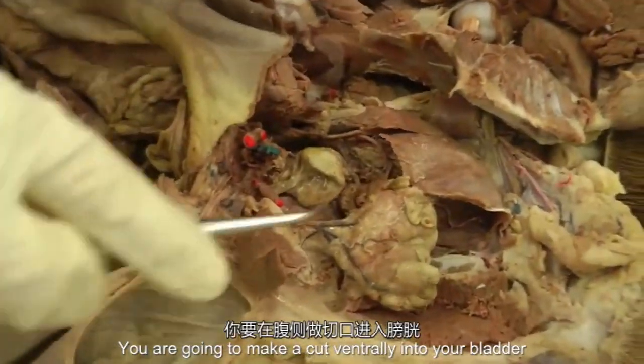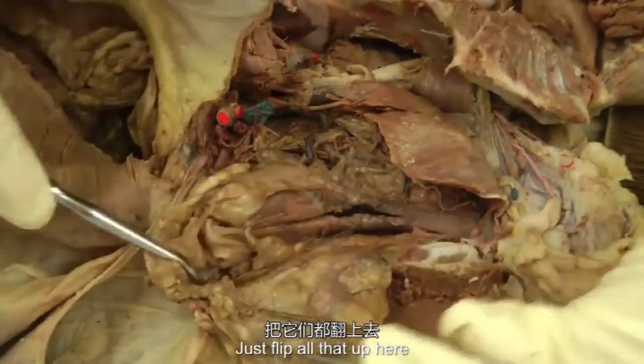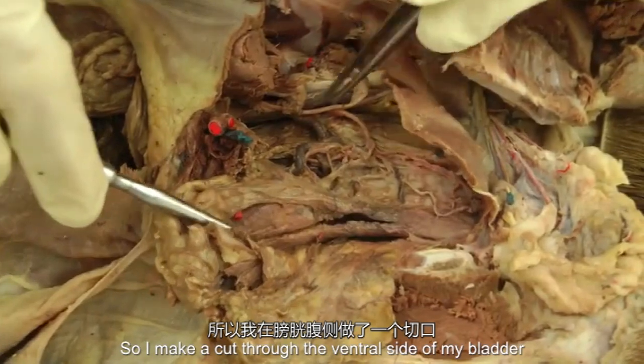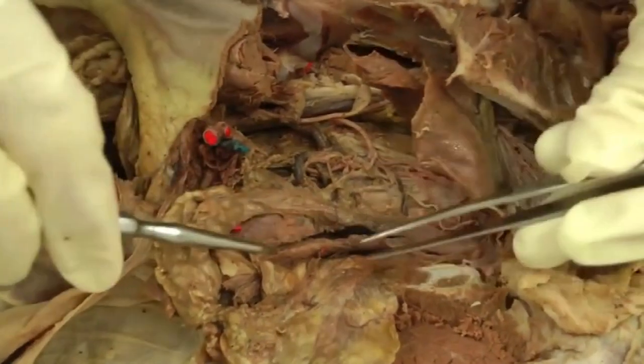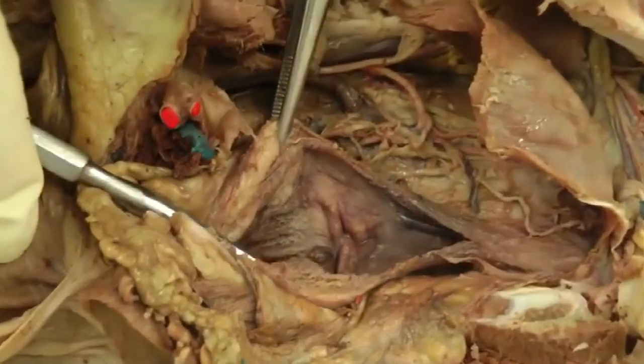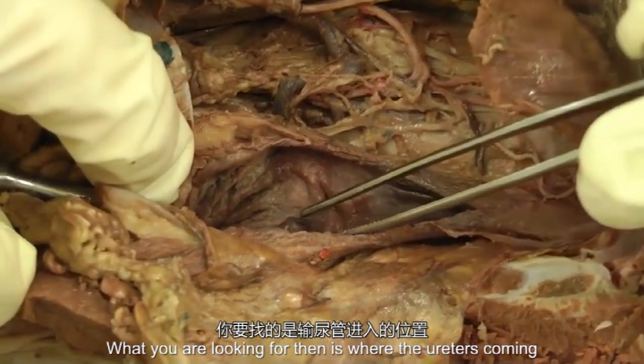You're going to make a cut ventrally into your bladder. I'll just flip all that up here. So I've made the cut through the ventral side of my bladder and down into the urethra. So you'll want to do that. And once you open that up, what you're looking for then is where the ureters come in.